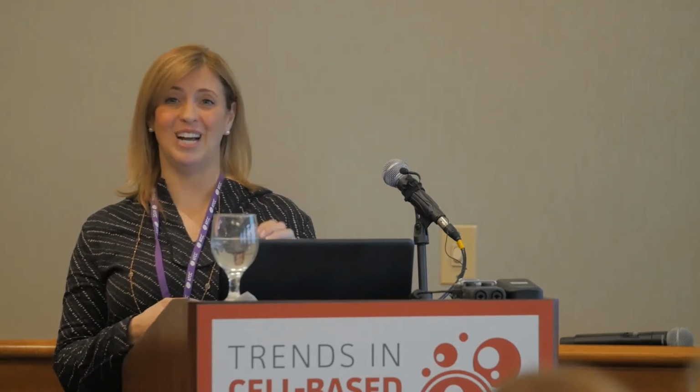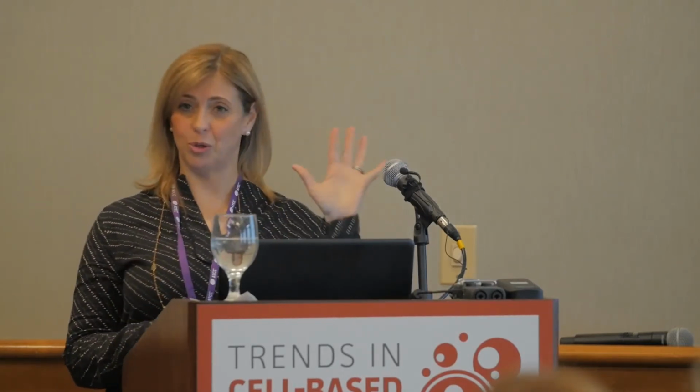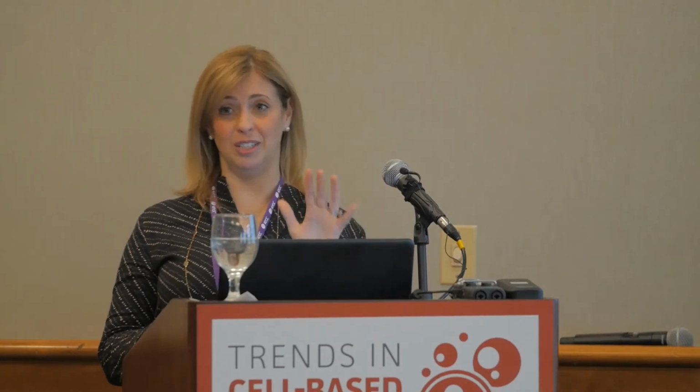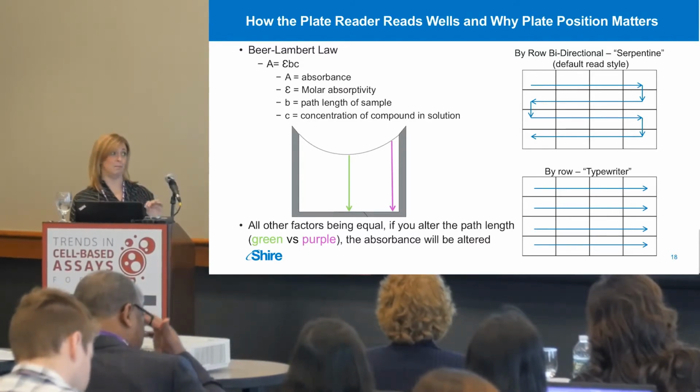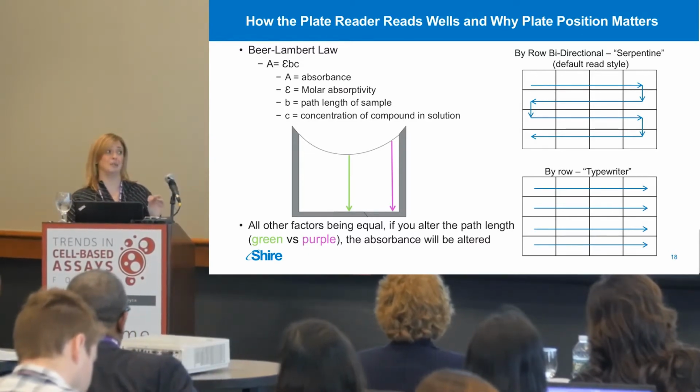Not fun. Not fun. What we realized is that this is specific to absorbance colorimetric assays. Thank God we didn't have any absorbance readout methods in QC to release commercial product or any product or clinical that use this. We were using fluorescence for all of our other methods, so that's why we didn't catch it earlier. It was just because we're using absorbance, and where path length makes a significant difference. And again, the program business, these days, you got to move. And so we said, look, this isn't going to work, but until we validate a new instrument, we're not going to meet deadlines.